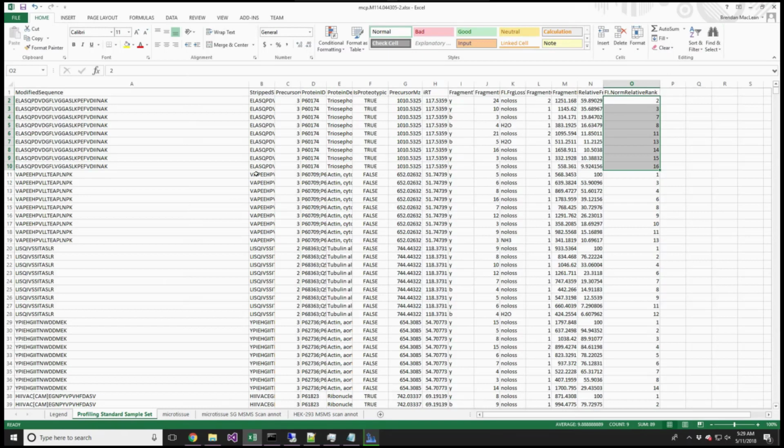Yeah, I think that was one of those ones where they use an earlier, so the Aebersold lab in that paper would tell you to use SpectraST to build your library, and some of the older versions of SpectraST were extremely permissive on neutral losses and things like that. And yeah, so all right, so that's that.